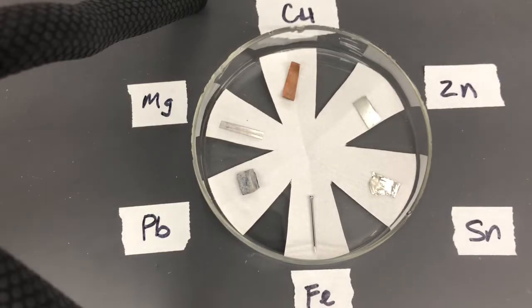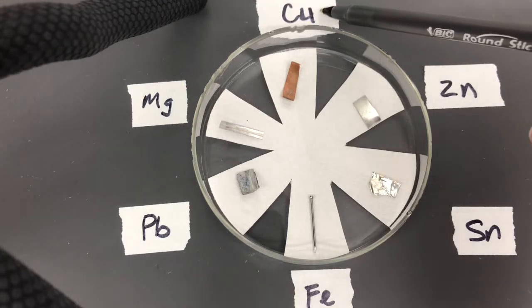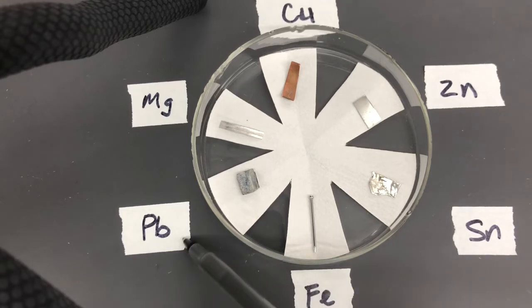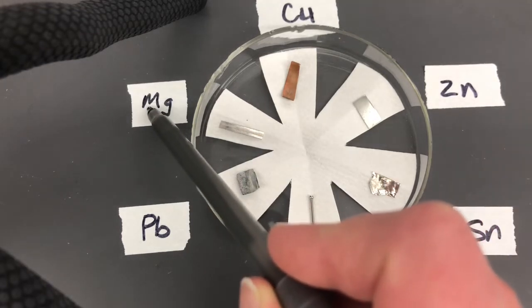In part 3, we're going to measure the voltage associated with connecting two half cells together. We're going to look at 6 different half cells. We're going to look at the half cell of copper and copper 2+. We're going to look at the half cell of zinc and zinc 2+. We're going to look at the half cell of tin and tin 2+. We're going to look at the half cell of iron and iron 2+, the half cell of lead and lead 2+, and finally the half cell of magnesium and magnesium 2+.